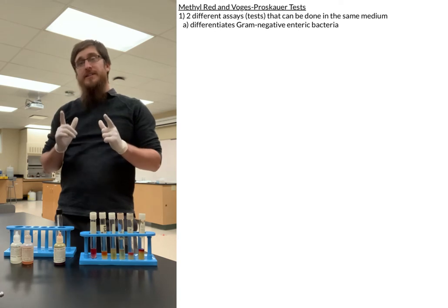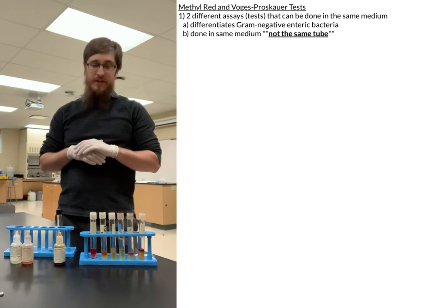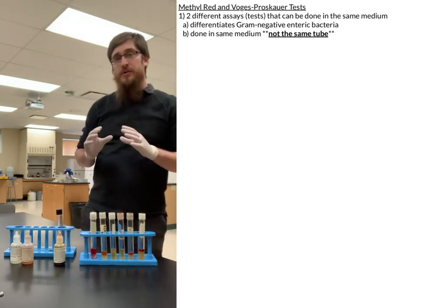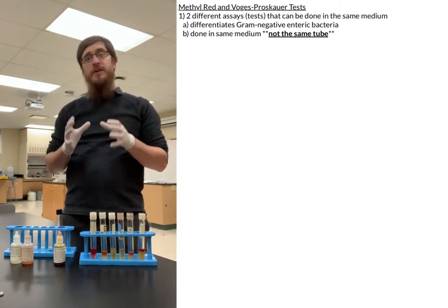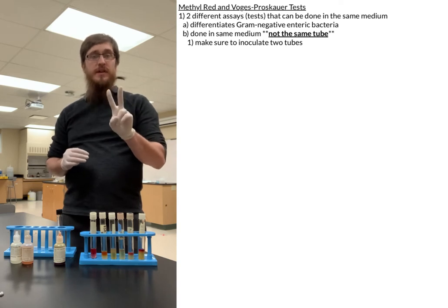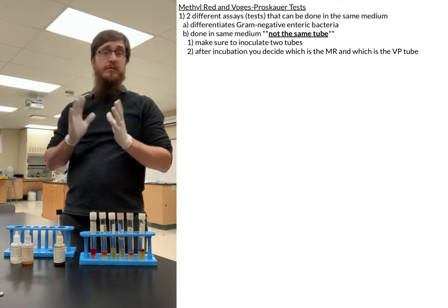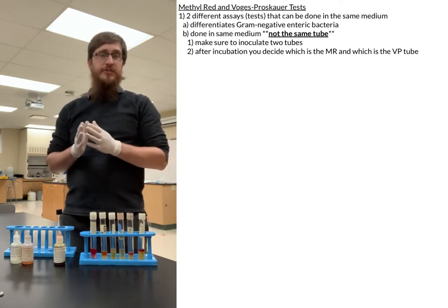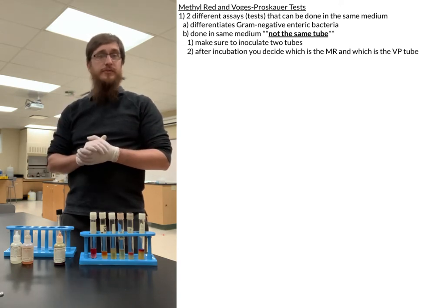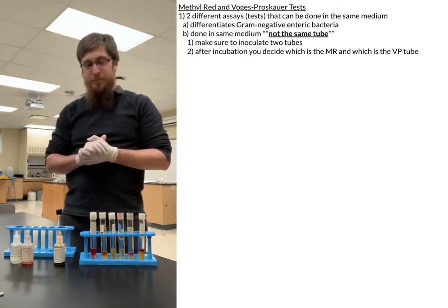Now, I did say again that they can be done in the same medium. This does not mean that they can be done in the same tube. So make sure that when you go to inoculate your tubes for the MRVP test, that you inoculate two tubes. And then after you've incubated them for 24, 48 hours to a week, however long we do it for, you can then just decide that your first tube is going to be the MR test, and your second tube will be the VP tube, something like that.